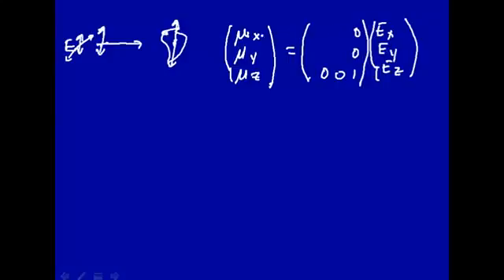However, let's look at the x. So we have an electric field here, and not necessarily will the electrons be shifted in the x direction because they might be bound to various atoms and so on. So it could be that if you have an oscillation of the electric field in the x direction, the electrons could actually be moved over into the y direction. So what you'll have are off-diagonal terms which couple the electric field with the way the electrons move when they're polarized.